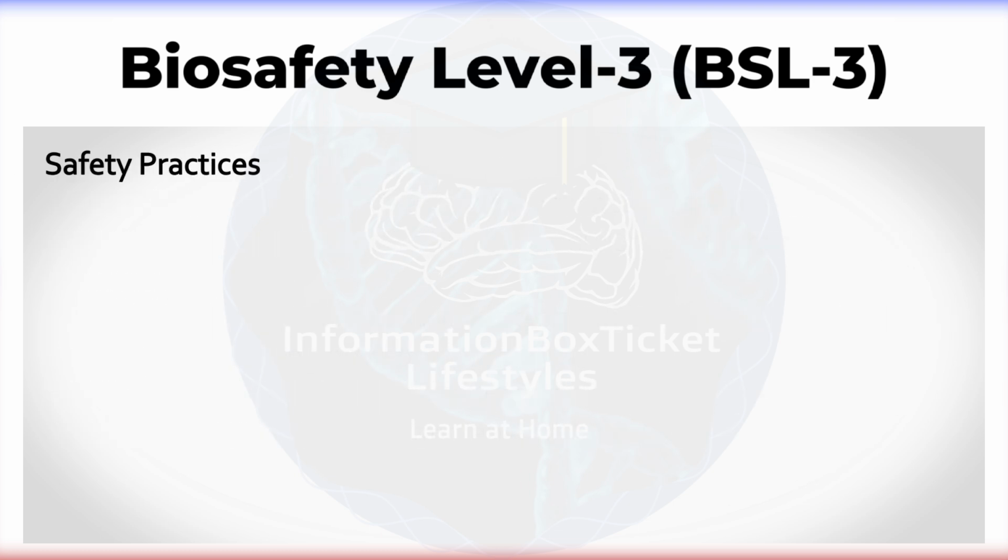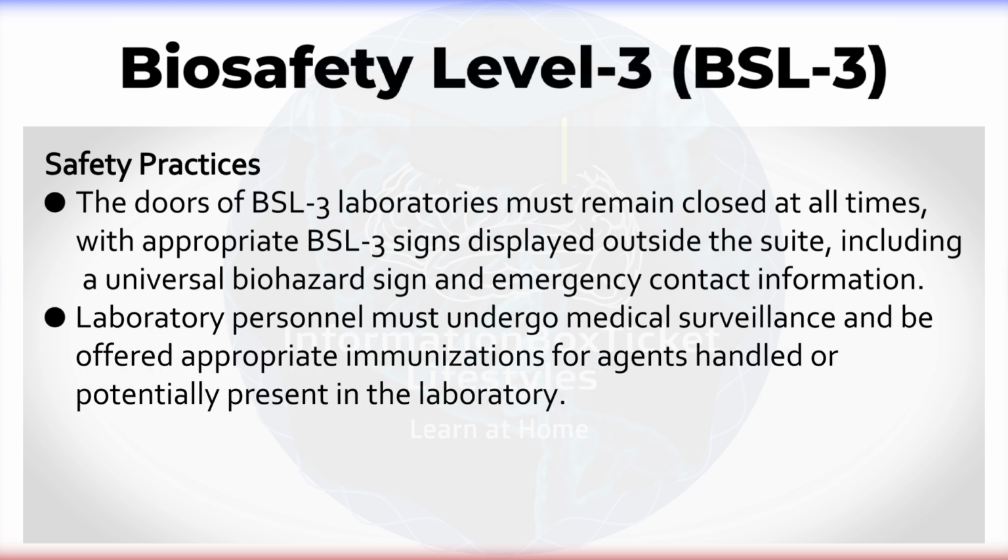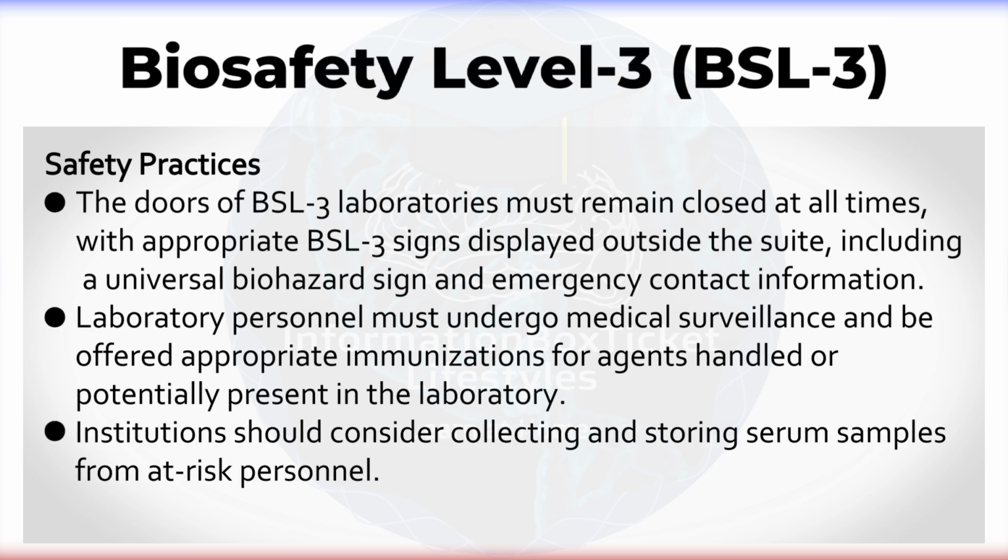Safety practices. The doors of BSL-3 laboratories must remain closed at all times, with appropriate BSL-3 signs displayed outside the suite, including a universal biohazard sign and emergency contact information. Laboratory personnel must undergo medical surveillance and be offered appropriate immunizations for agents handled or potentially present in the laboratory. Institutions should consider collecting and storing serum samples from at-risk personnel.